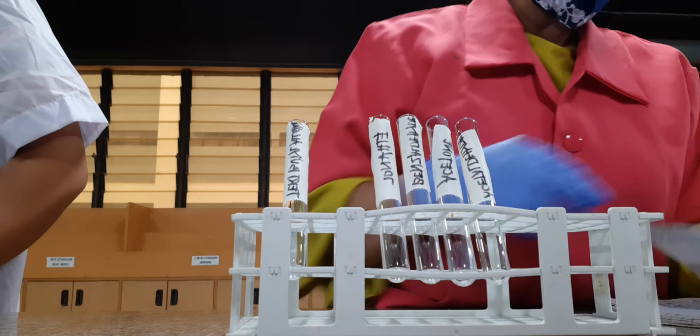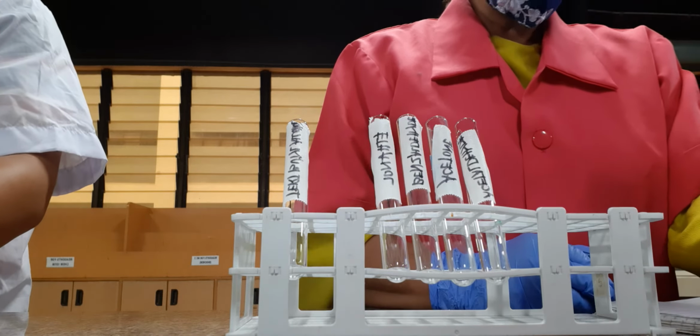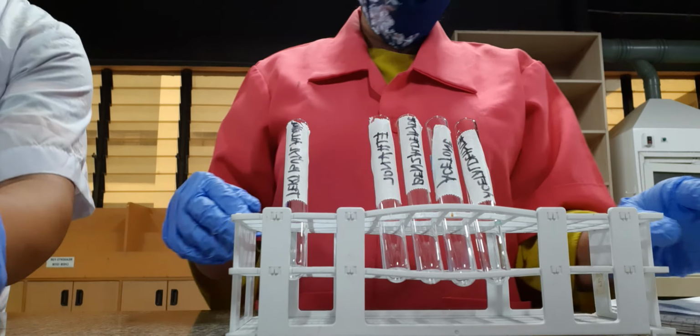Okay, so we'll have here 1 ml each of this reagent, and then another 1 ml for our Tollens test.